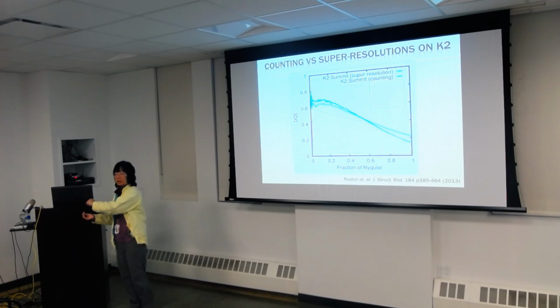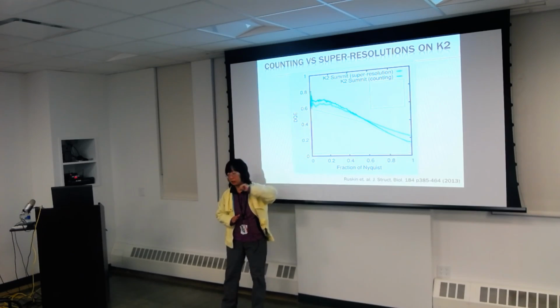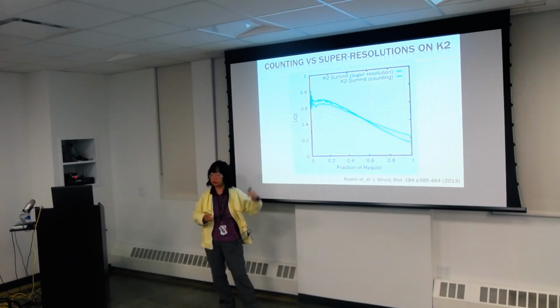Remember we said that what you need to get aliasing is a signal that's beyond it. Now, by sampling even finer than your actual pixel, by some mathematical trick, you ensure that it will never be limited by it. So it makes its DQE higher. You see in here, the DQE for the super resolution can be higher. So that's basically what we just learned.